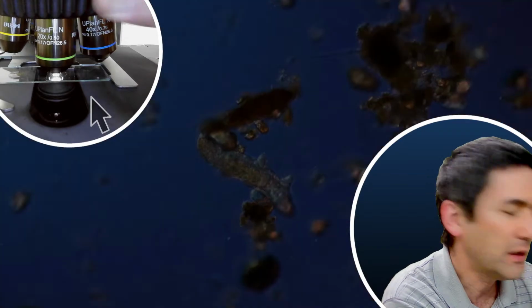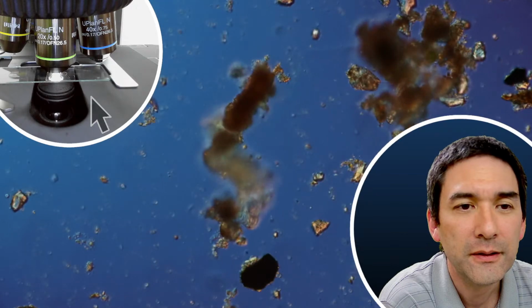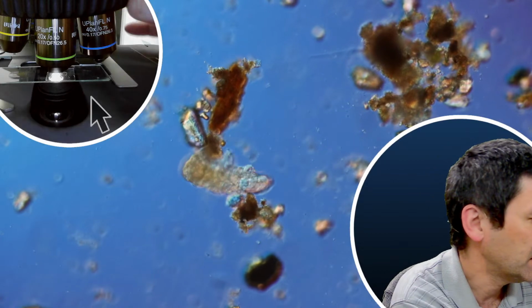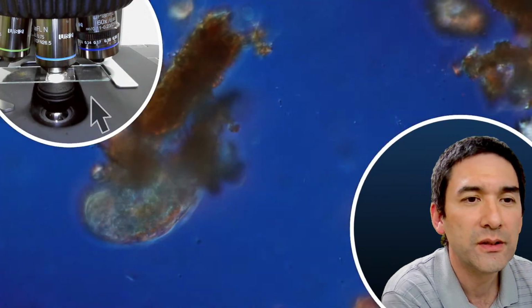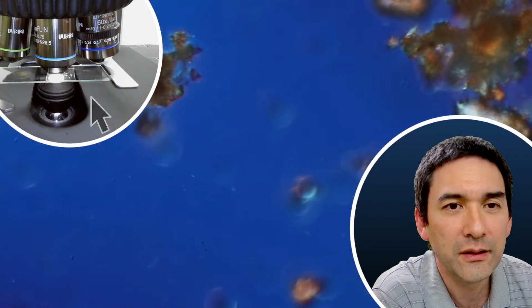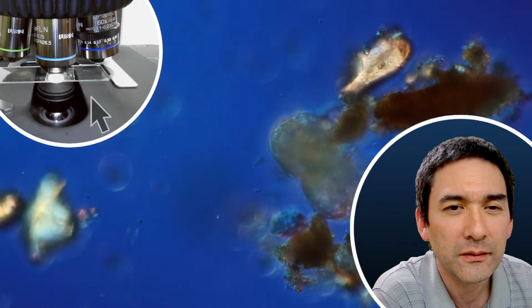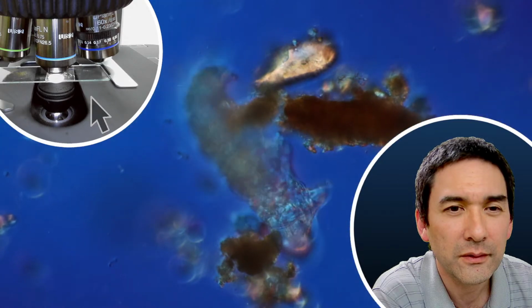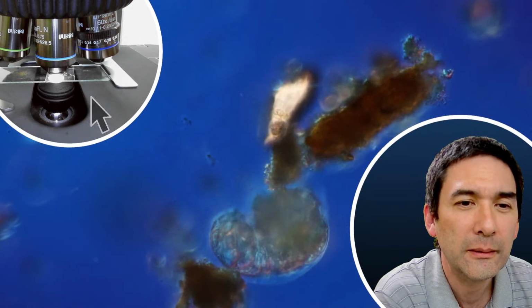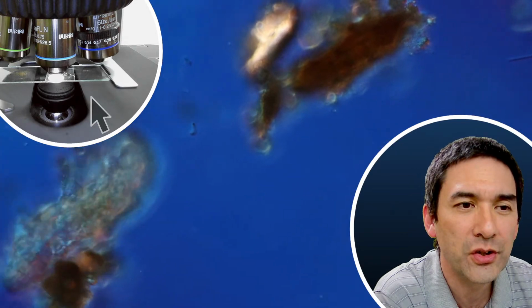So it's now 200 times. Go up with. Okay. So, and now let's really make it big. I'm very happy that this kind of worked. So, go up with light. Of course, the higher I go up with the magnification, oh, you see the water liquid is spreading under the cover glass. Okay. Okay, here we go. Always moving. Maybe if we're lucky, we're able to also see some of the claws.